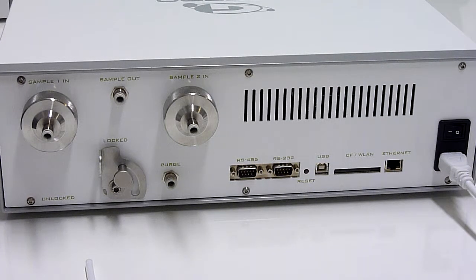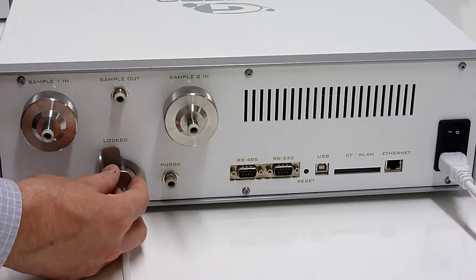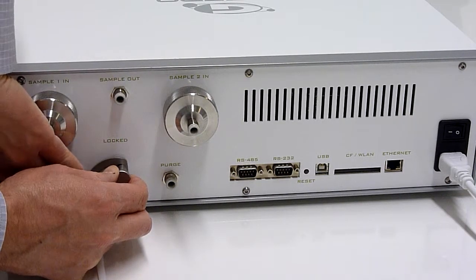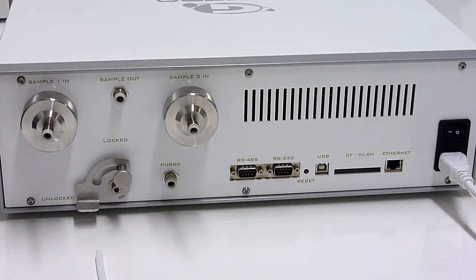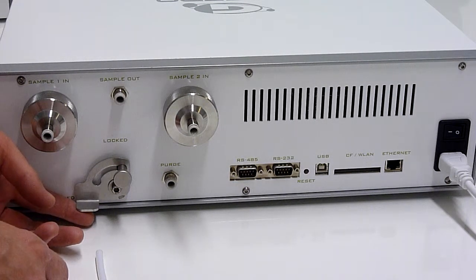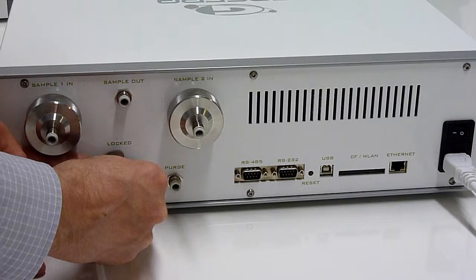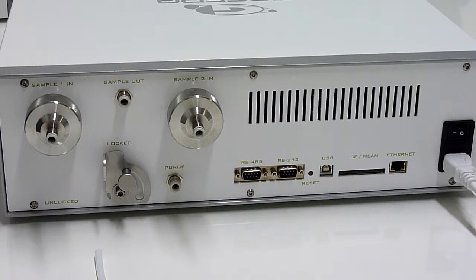During transport you can lock the system, and when in operational mode you can release the locking with the lever over here — you just pull out and release the lever. The instrument is now in operational mode. When going into transport mode, you turn the lever again and secure it, and the instrument is on the rail.